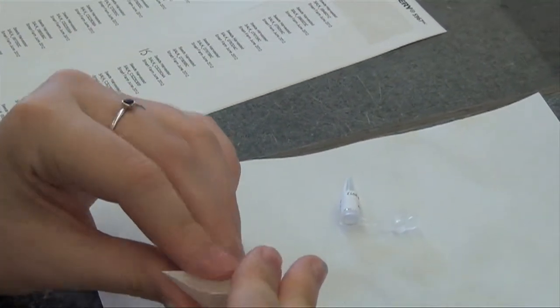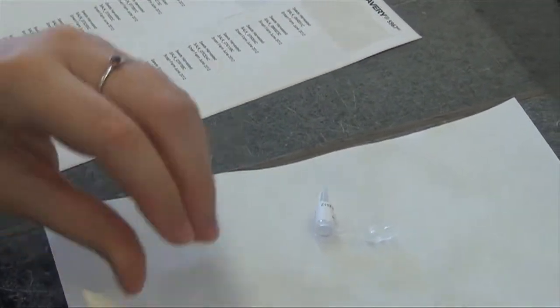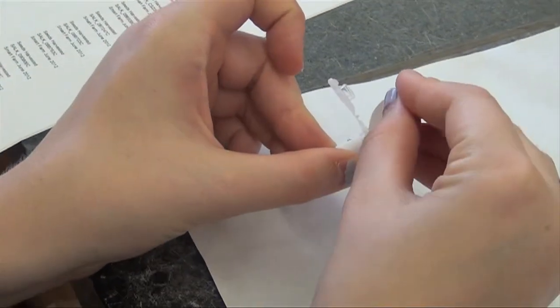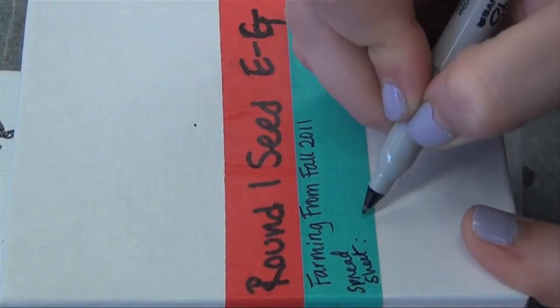Make sure that you do this over a white piece of paper, in case you spill some. Check that there are no stray seeds on this paper between each tubing to avoid contamination. Seed tubes should be boxed and organized in your refrigerator.